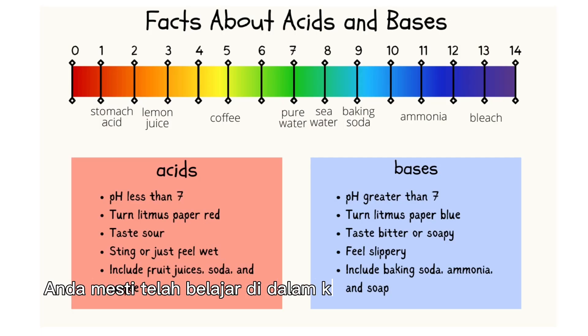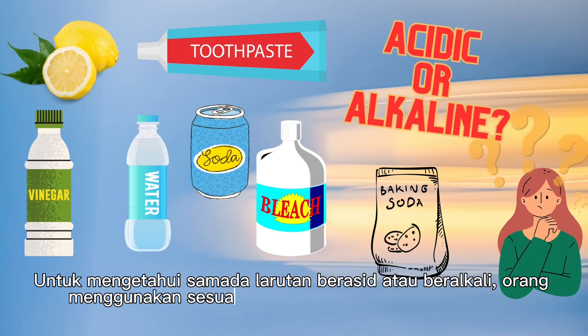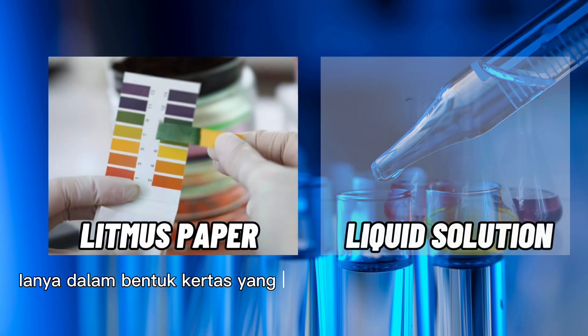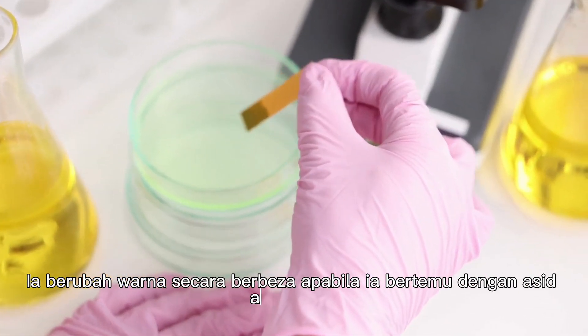You must have learned in class about acids and bases. To know if a solution is acidic or alkaline, people use something known as an indicator. They come in a paper form known as litmus paper, or as a liquid solution. It changes color differently when it contacts an acid or an alkaline.